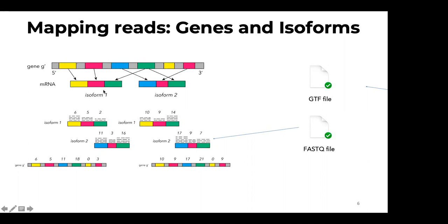Isoform 1 is a different protein, isoform 2 is a different protein, but they are transcribed from a single gene through alternate splicing. To capture isoforms, we use different reads which are mapped onto specific exons, in different quantities, and FASTQ files give different sequences for these reads.